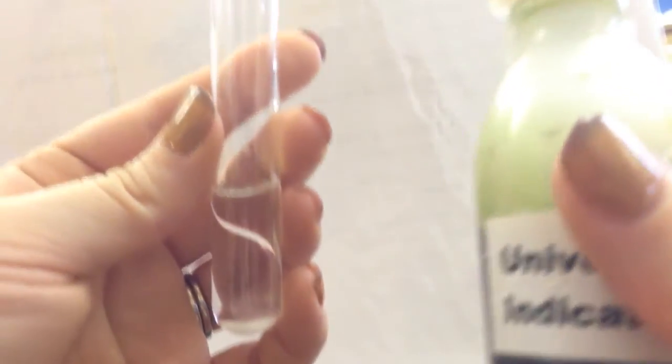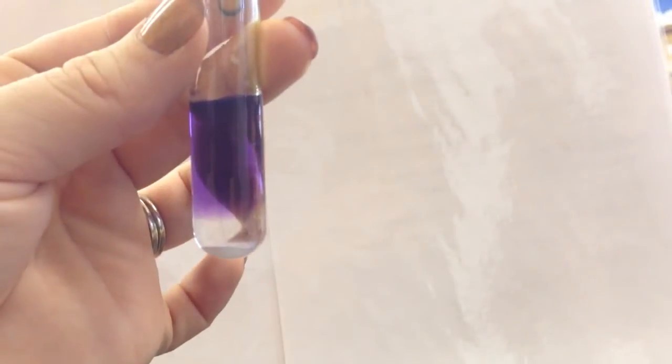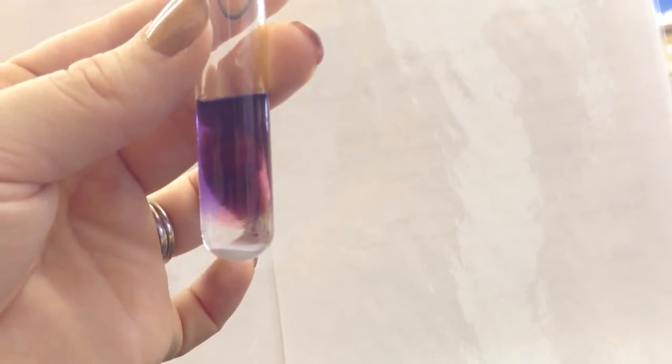Then we need to add in a few drops of our universal indicator — 1, 2, 3 drops. You can see it's starting to change colour. So we now need to drizzle in a small amount of 4% ethanic acid, and again, really carefully, try not to disturb the layers that are starting to develop. I'm just going to run this very slowly, very patiently, down the side.